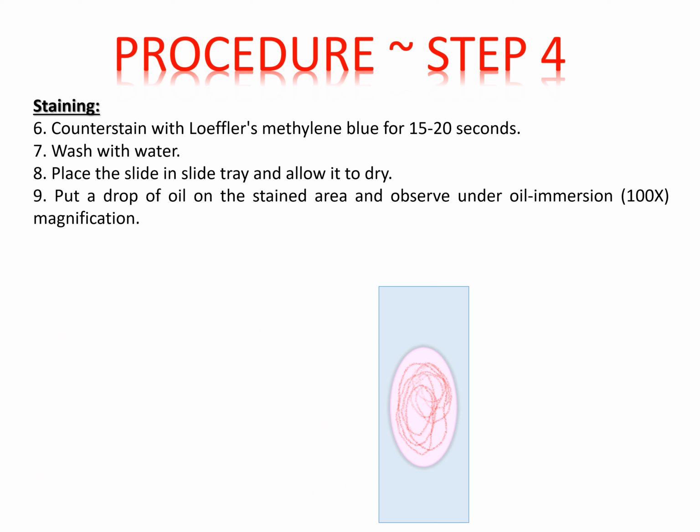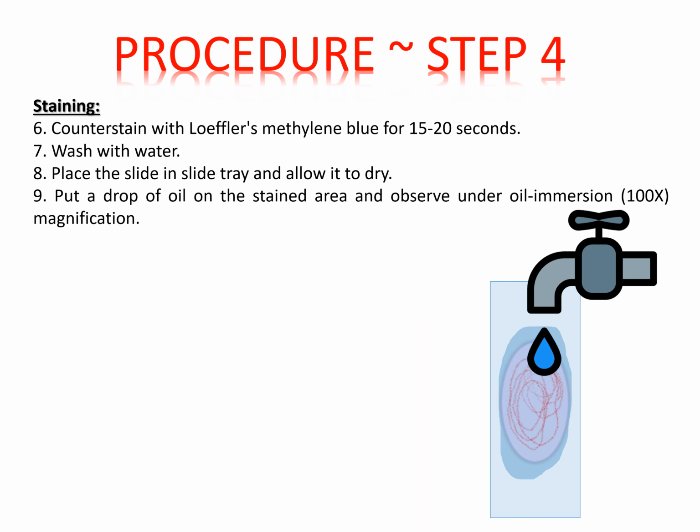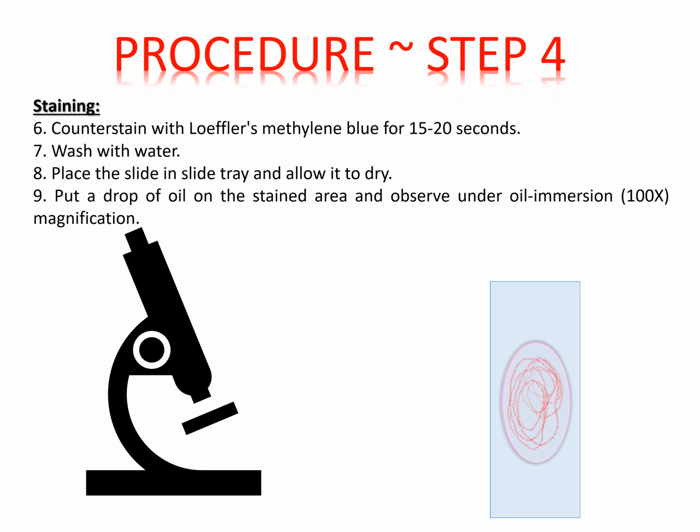The final step is counterstaining. Counterstain with Loeffler's methylene blue for 15 to 20 seconds. Wash with water. Place the slide in the slide tray and allow it to dry. Put a drop of oil on the stained area and observe under oil immersion 100x magnification.